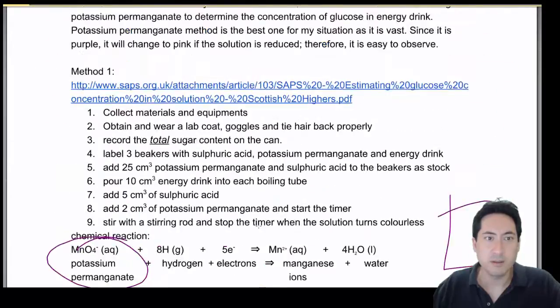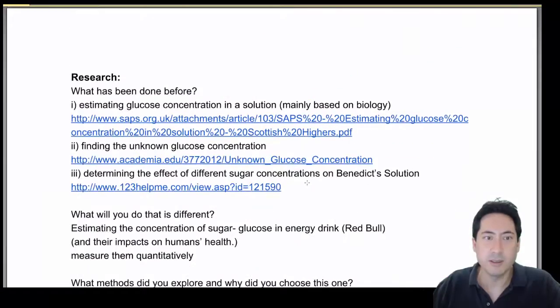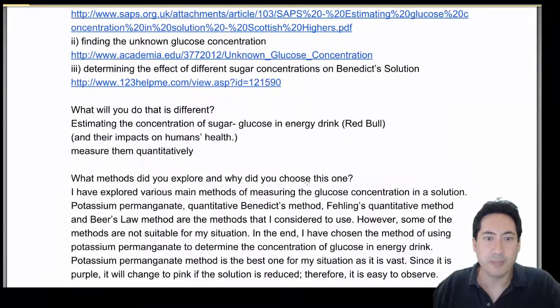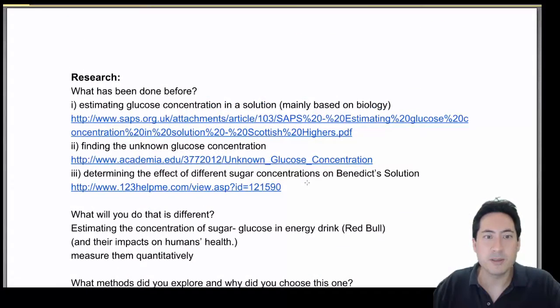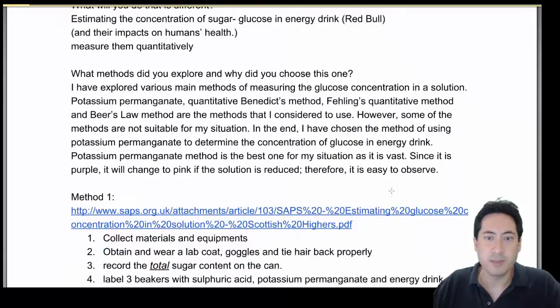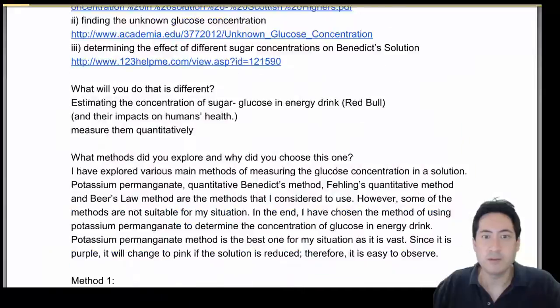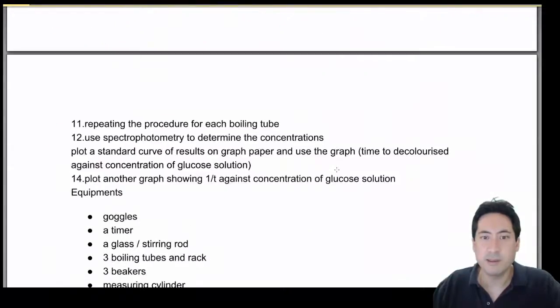So is the glucose getting oxidized or reduced? Where's all the chemistry in that? And what about the other sugars? Are they interfering? You've got to think. You've got to have all this in your design, and you've got to account for it. Maybe have positive and negative controls for interfering sugars.